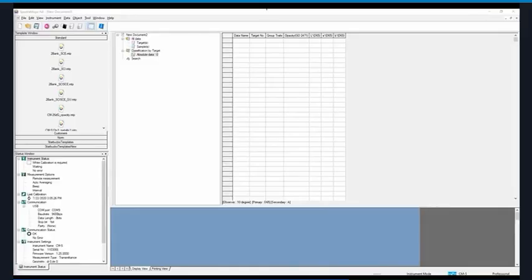When you encounter specimen with relatively high haze, you may also want to measure their opacity. For example, ASTM refers to specimen with 30% haze or higher as having high haze. And at that point, opacity measurements are recommended instead of transmission haze. However, for many applications, haze values above 30% may still provide valuable information, and you may choose to keep the haze data but supplement it with opacity measurements when a certain haze threshold is met.